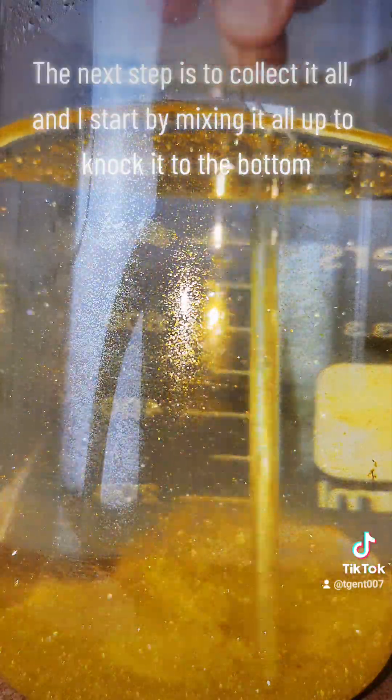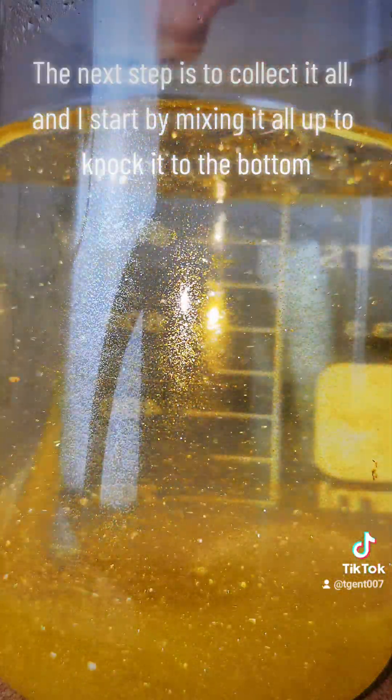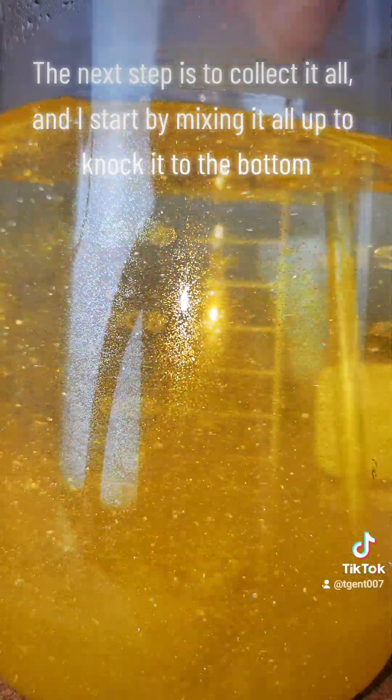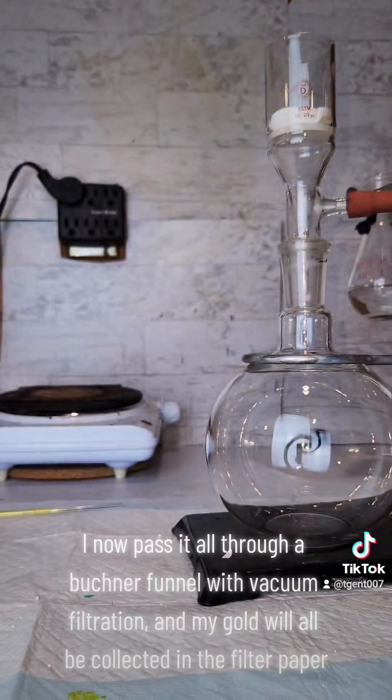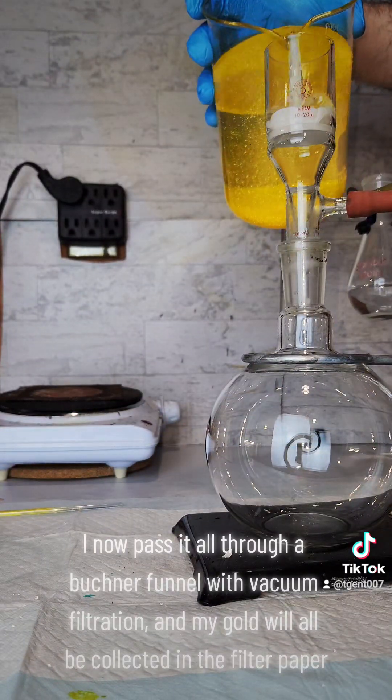The next step is to collect it all, and I start by mixing it all up to knock it to the bottom. I now pass it all through a Buchner funnel with vacuum filtration, and my gold will all be collected in the filter paper.